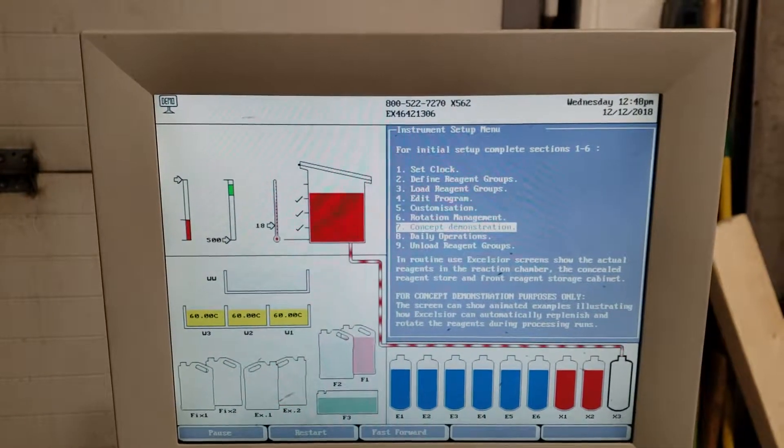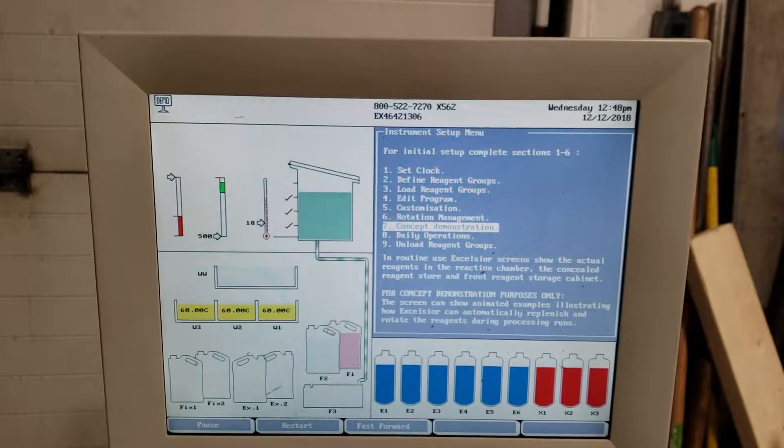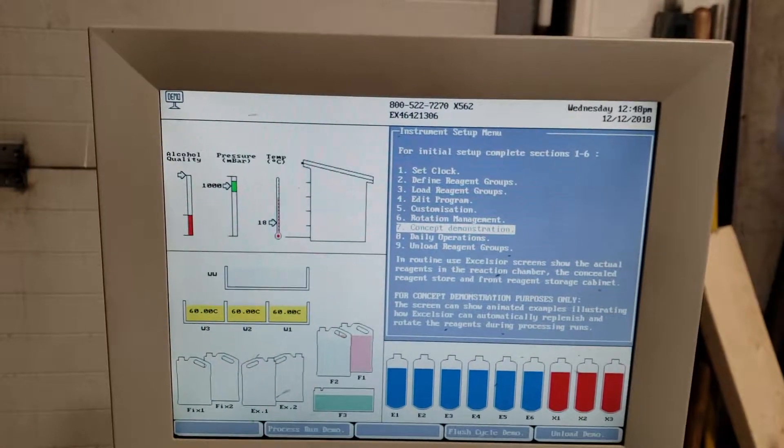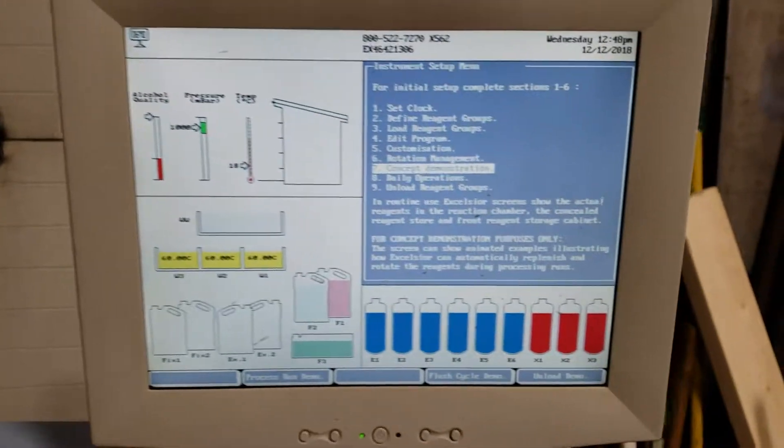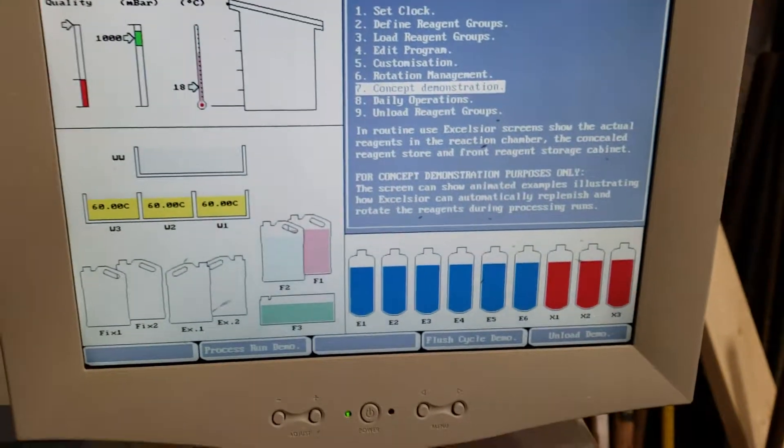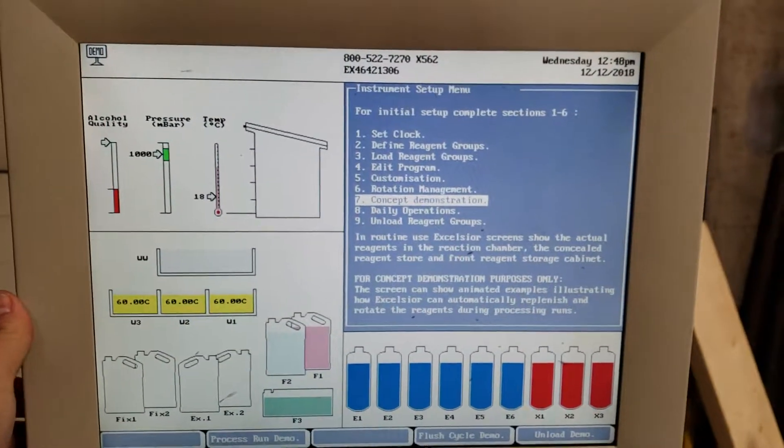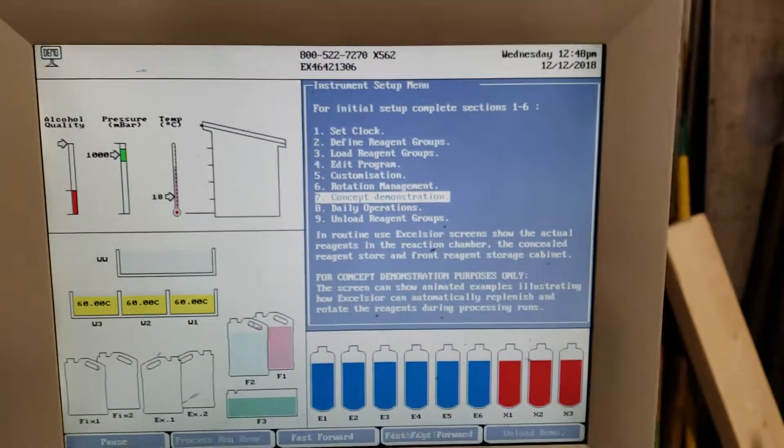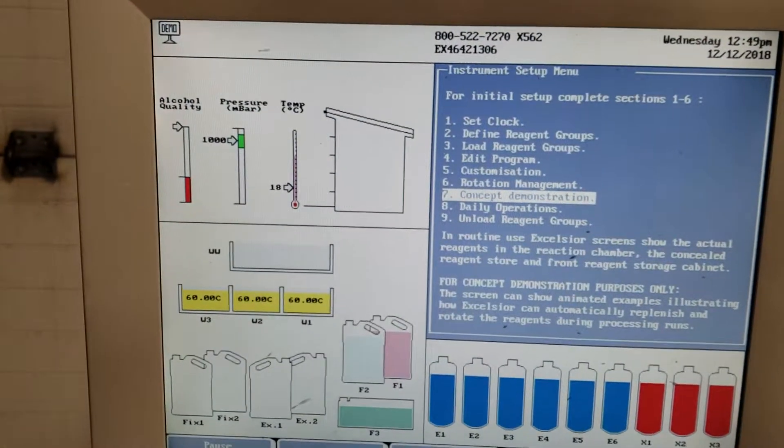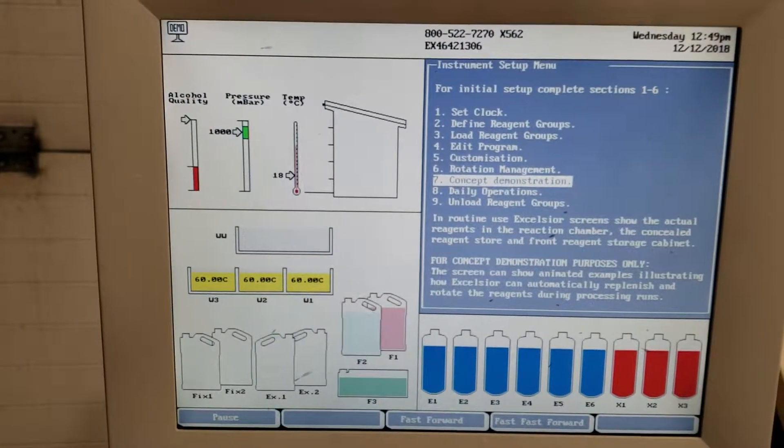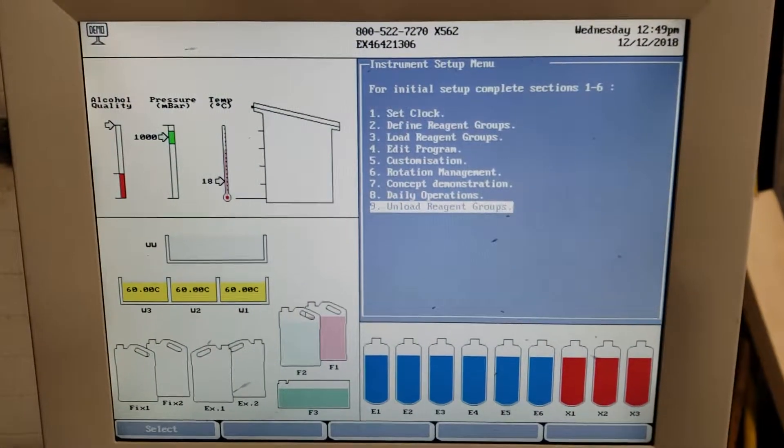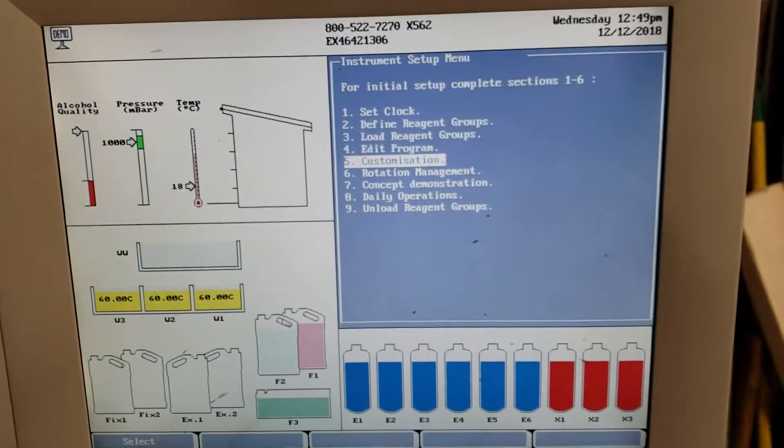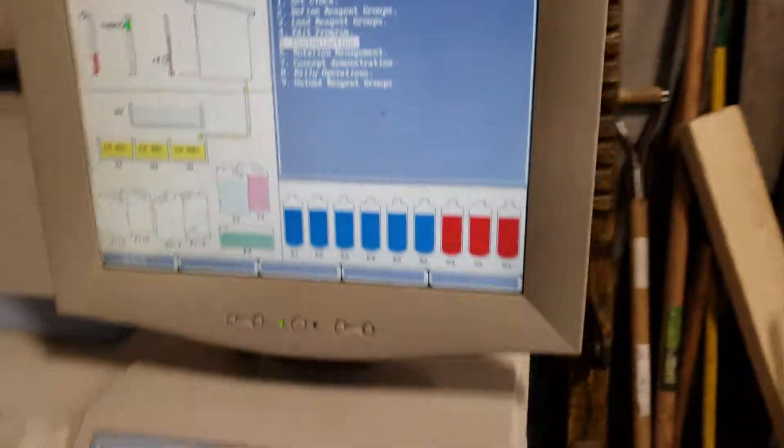I'll let this run. That was the demo. I need to bend down to see this. Unload demo. You can go through the menus again. I don't really know what I'm doing here, so that's it.